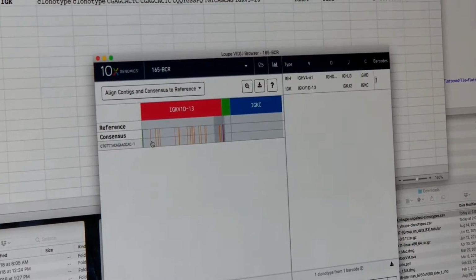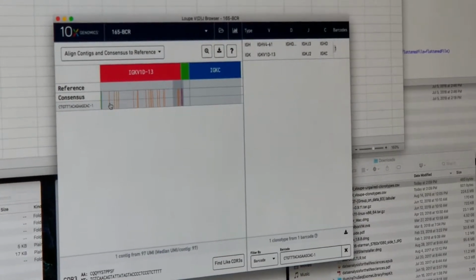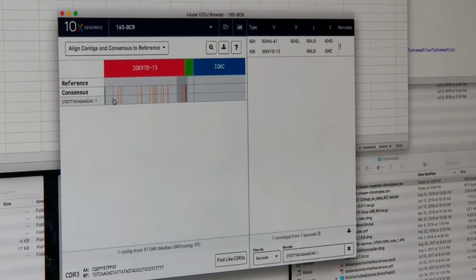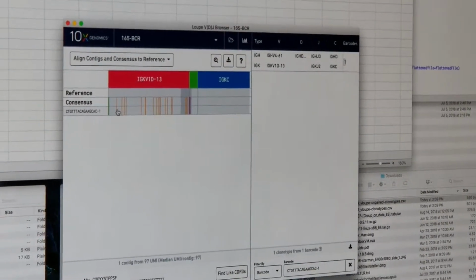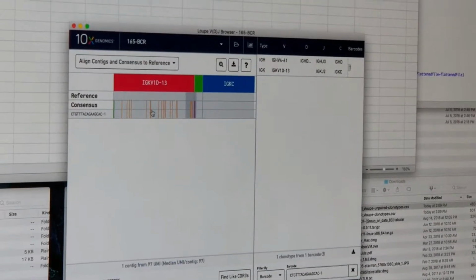I see a bunch of, but the question is, is this software smart enough to see the deletion or an insertion or a mutation and know that changes the amino acid sequence? The majority of these tools that say, hey, here's your stop codon, are only looking for the actual stop codon. And they're not going, oh, by the way, upstream you had a frame shift where you lost a base and now you have a stop early. It doesn't, none of that does. Well, there shouldn't be a stop codon there, right? No, right. But I'm saying if one of these insertions or these mutations switched it out to a stop, then you would have an early termination.